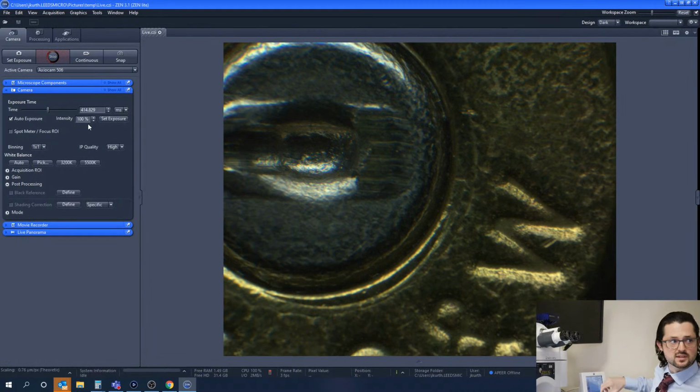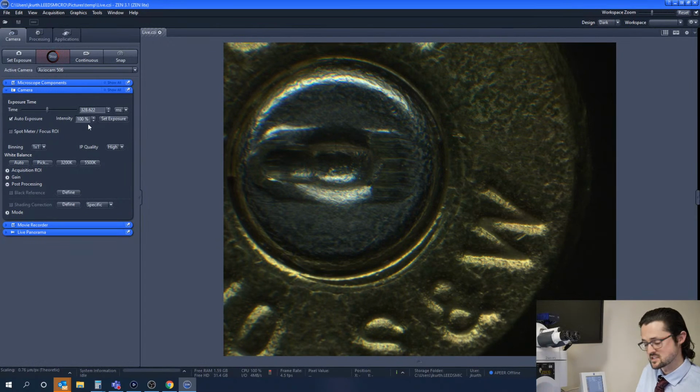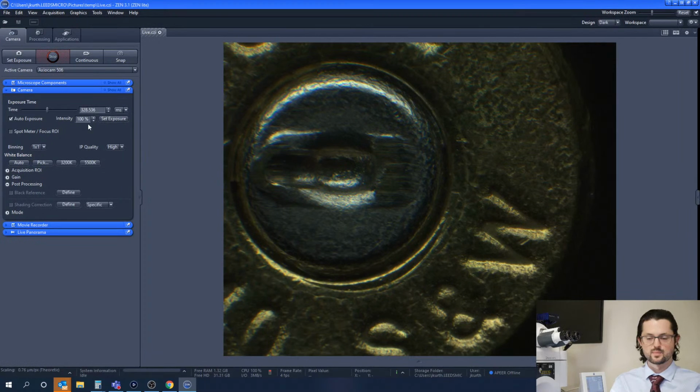You notice when I zoomed in, there's a bit of a delay. In fact, right now, if I move my stage around slowly, you're going to notice the camera can't necessarily capture my movement in real time. And we'll get back to the spot focus area. The big thing with image quality, captured pictures, is to improve your camera's frame rate, so that when you're seeing things, you're not having to wait for the camera, you're not maybe slightly out of focus, that type of thing.